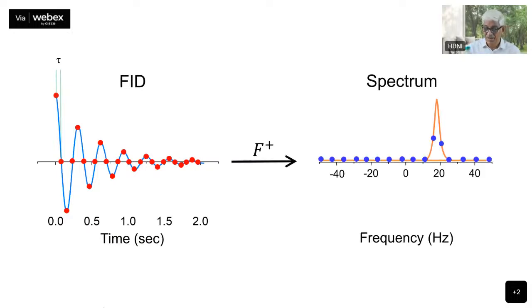And then the spectrum will also be a digitized spectrum, right? When you do Fourier transformation, you get a digitized spectrum. The FID is digitized, therefore you also get data points in the spectrum. So as many data points are here as are here, but half actually, because half of them go into the real component and half into the imaginary part. Whatever the points are here, half of them you will get in the real spectrum, and the remaining half will go into the imaginary.